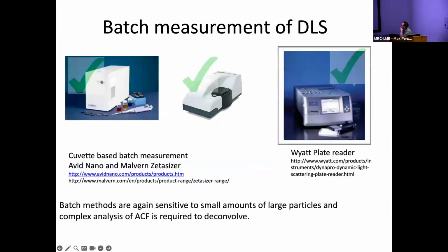So in the biophysics facility, we've got different DLS machines. We've got this batch machine, a cuvette-based method. If you use this, you have to be very careful. You have to clean it really well. Make sure there's no dust particles in your buffers or in the cuvettes.